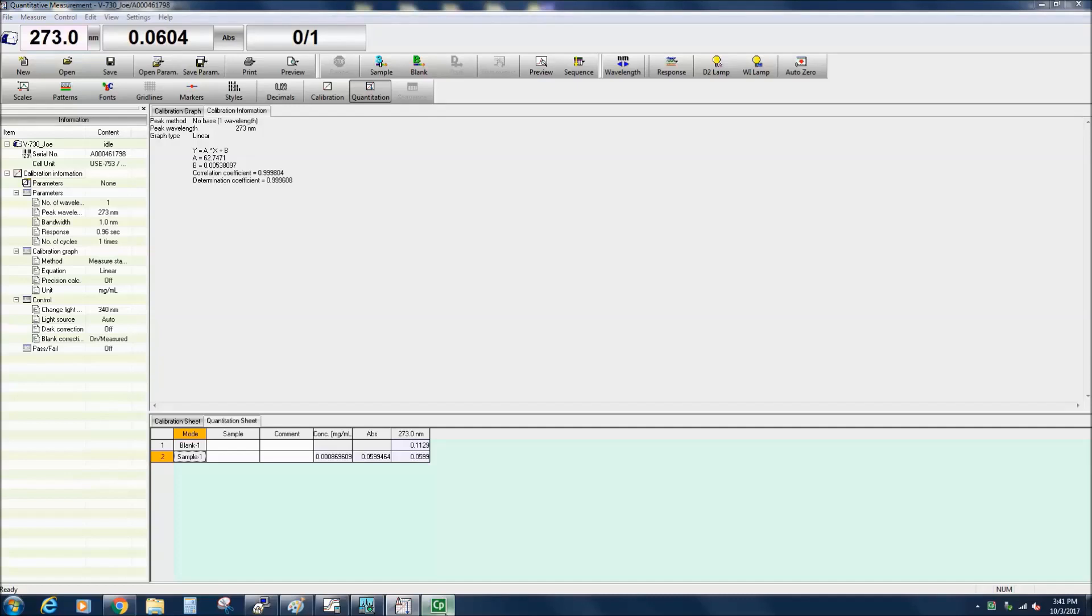The quantitative results can be saved by going to File Save As or selecting the Save icon in the toolbar. You can also use a previously created calibration curve. To do so, click the Open Parameters icon and select the calibration curve you wish to use.